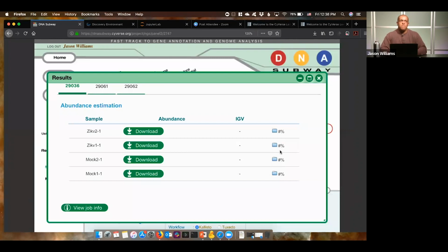It's a factor of pseudo-alignment, but of any alignment. It's also a factor of how well the transcriptome is covered in your sample versus the entire transcriptome, right? Certain developmental stages or disease conditions will not be present for sure. So you wouldn't expect to get 100% alignment rate. If you're getting something in the 10s, 20s, 30s, you need to look at whether there was some sample mix-up.